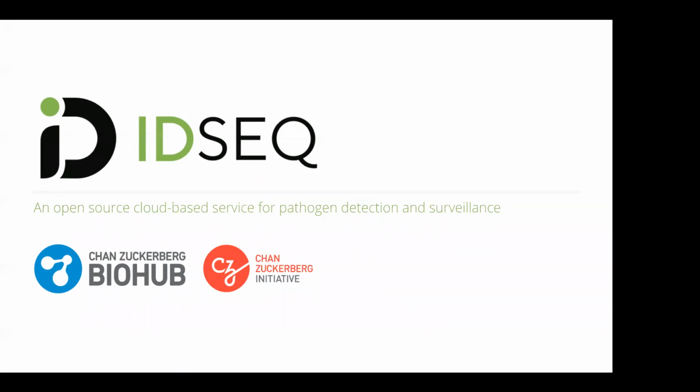It is a tool that was developed at CZI, or the Chan Zuckerberg Initiative, which is a philanthropic technology company, but it was developed really in close partnership with the Chan Zuckerberg BioHub, which is a nonprofit group of scientists, and we still work really closely with that group in order to make sure that we are developing a tool that is solving real needs of scientists.